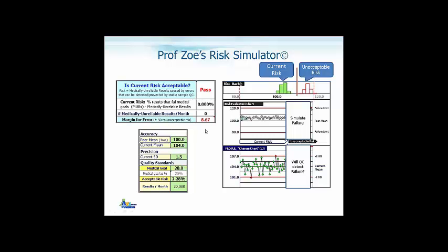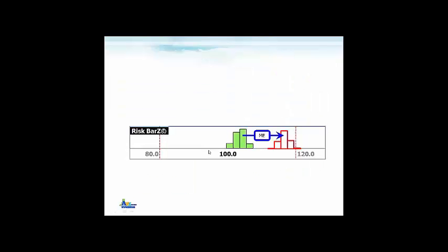We can then come in and simulate a failure. So what we do with every single QC sample is, after this line, there are 20 points, and one of them will fail. So that means the risk after here is unacceptable. Can you draw a line between where you are now and unacceptable risk? And will QC detect that change? And in this instance, it will.